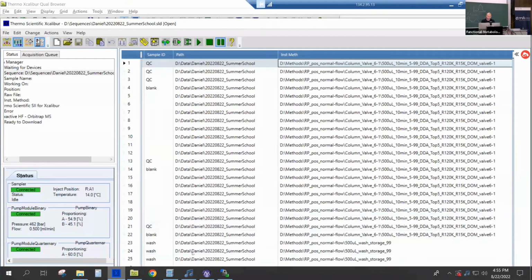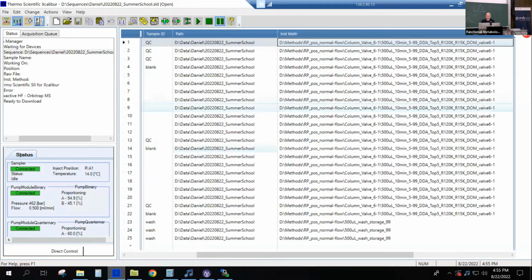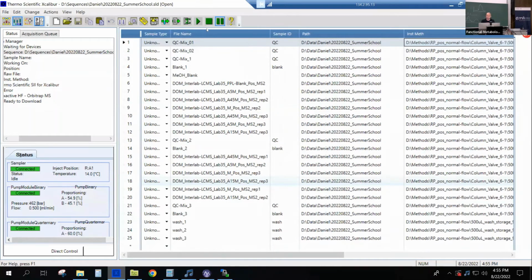Okay, so we have our sequence, and that is basically a little bit what Martin showed you earlier, just that I did it with my very own taste of things, right? So we don't have a pooled QC here. We run MS on all the samples. I have these QC runs before and after, or before and in between the samples, and then my different samples here are run.